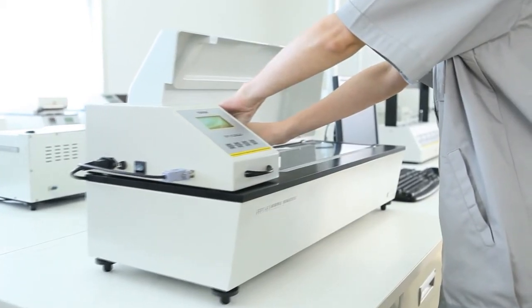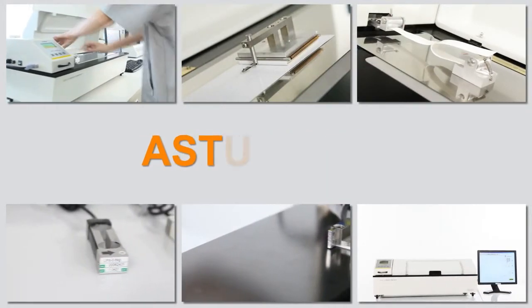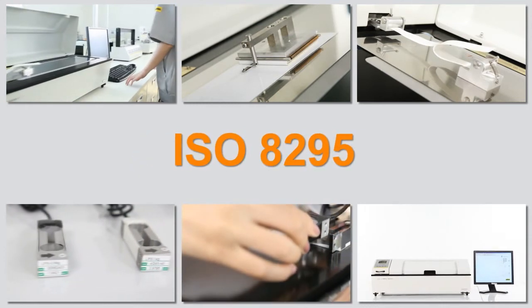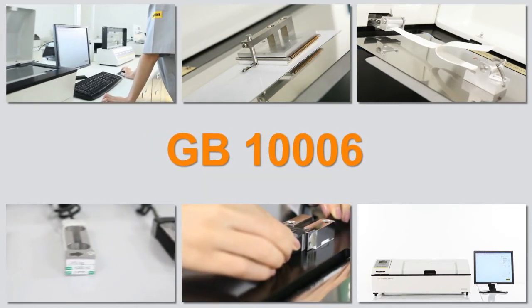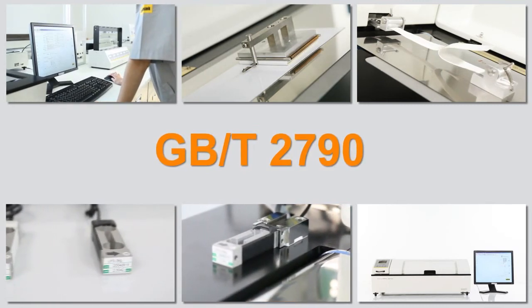The testing principle complies with ASTM D1894, ASTM D3330, ISO 8295, TAPPI T816, GB10006, GBT2790, and other international standards.